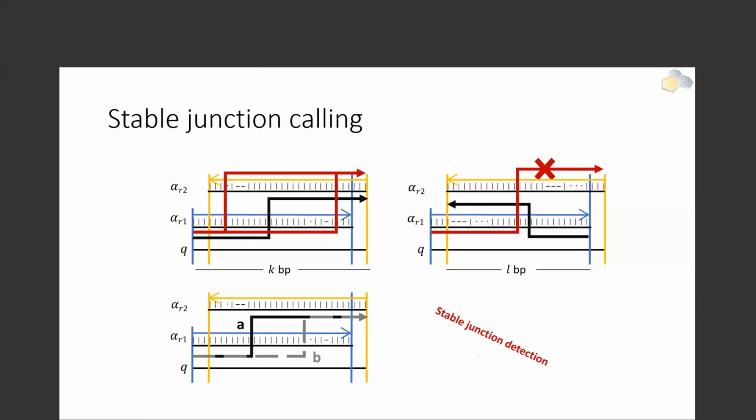These mutations are there just because the virus evolves. We cannot disregard them. We cannot remove these reads, as a lot of splice junction algorithms do for RNA-seq, for example. These are exactly the reads that justify these DVGs, and that was the need for this tool, to look into it in such a sensitive way, including all these mutations.